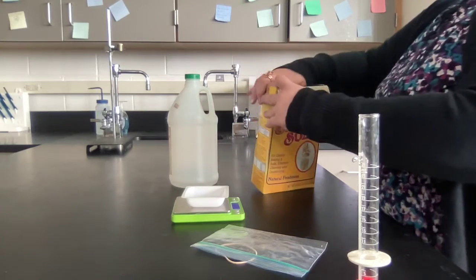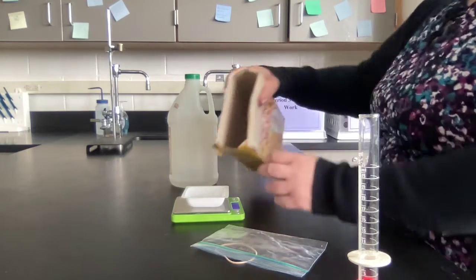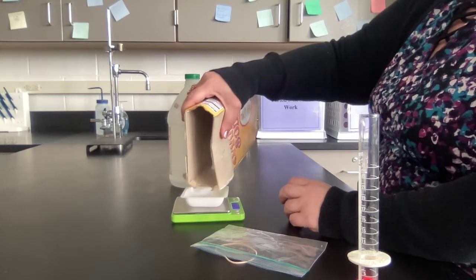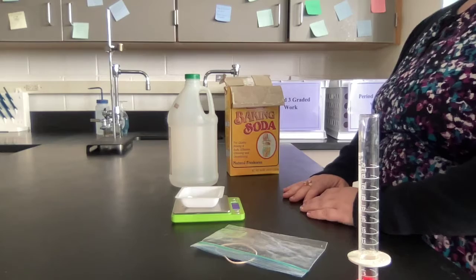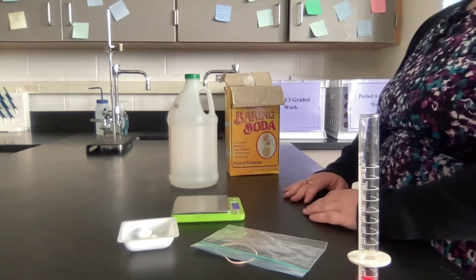You're then going to get some baking soda, and you can use a scoopula to get this out so you can be more precise. And you're going to put that off to the side.